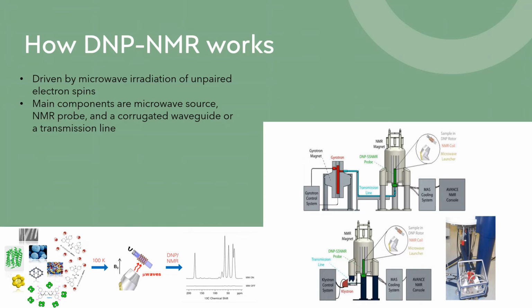From there on out, it's converted from transverse kinetic energy into microwaves. We could see the sample right over here on the bottom left being converted into the microwaves, which then get converted into an NMR signal.